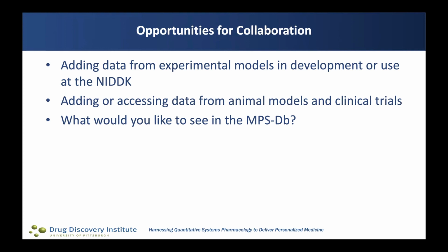If there are people within NIDDK that have models or would like to make use of the MPS database resource, they should contact us and we can give them some help in getting started with creating and uploading data. There's a little bit of setup we have to do in advance for each group that's going to be contributing data. We have to establish a center for them because that's how we track them. That's something we do at the very beginning with the group. Once their center is created, they can operate more or less independently, but we still give them training as needed.